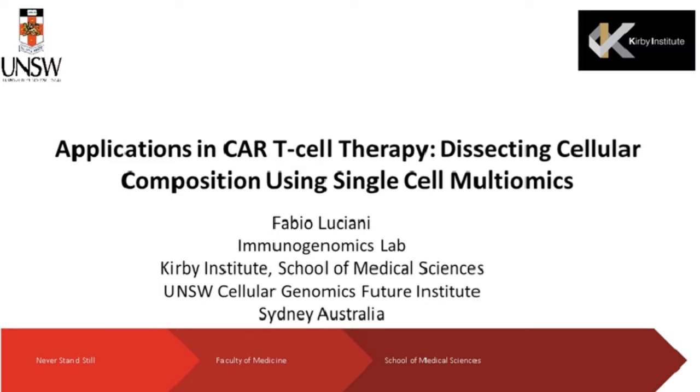Thank you, Jeremy. Welcome, everyone. Today, I'm going to share with you some recent work in our laboratory on the application of single-cell multiomics to study CAR T-cell therapy. The goal of this presentation is to dissect the cellular composition, as the title says, of this therapy and use the technology to unravel the heterogeneity and molecular signatures of those cells. I'm going to just move now to the next slide.